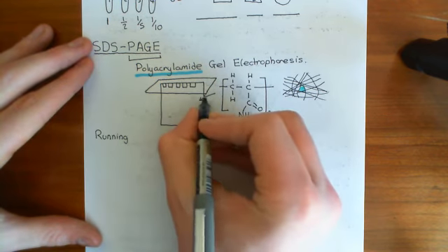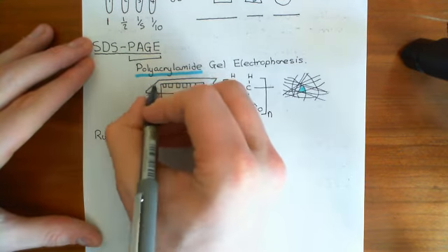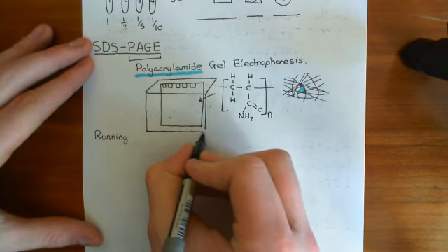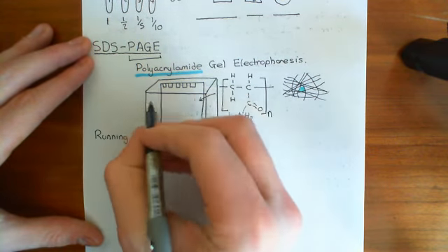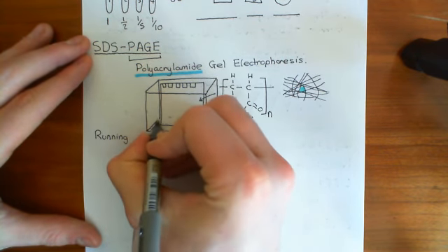They're little plastic tubs, and it will have all of the electrical stuff set up as well, so all you'll have to do is plug in 2 wires. But I won't show all of that, I'm just showing it is basically a little tub here, and the gel will be in contact with a fluid, and basically the fluid that you put around the gel is what's known as a running buffer.